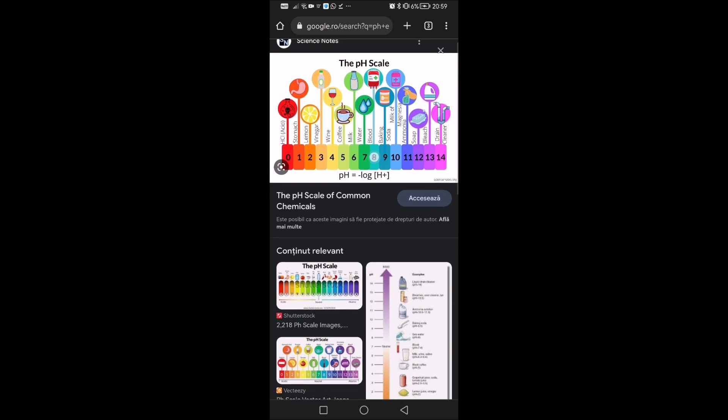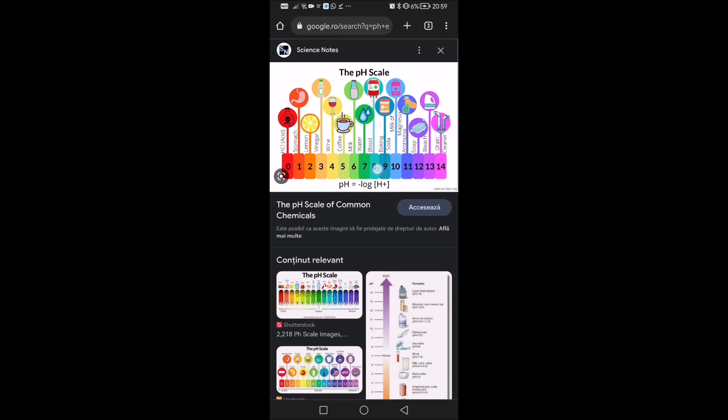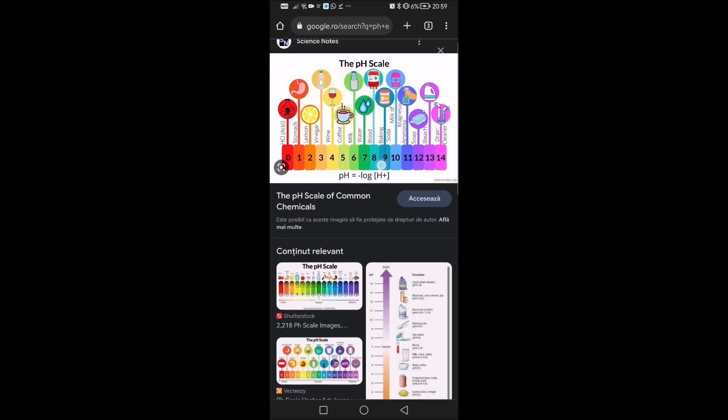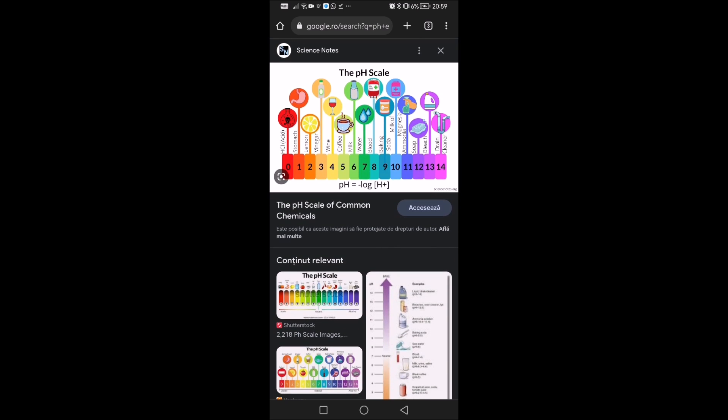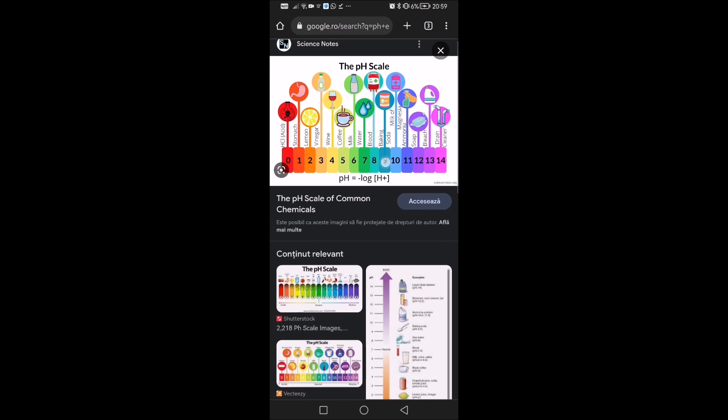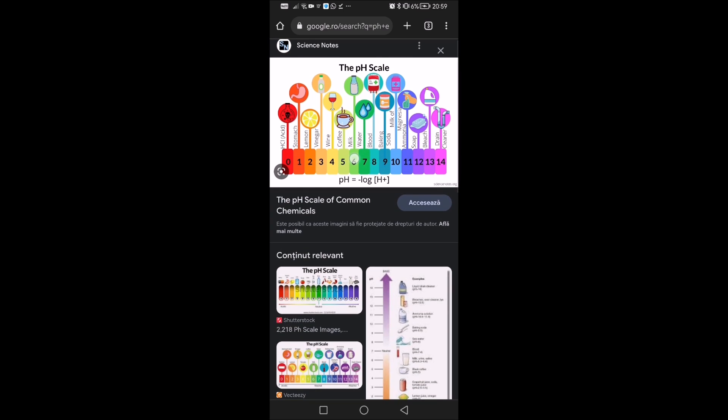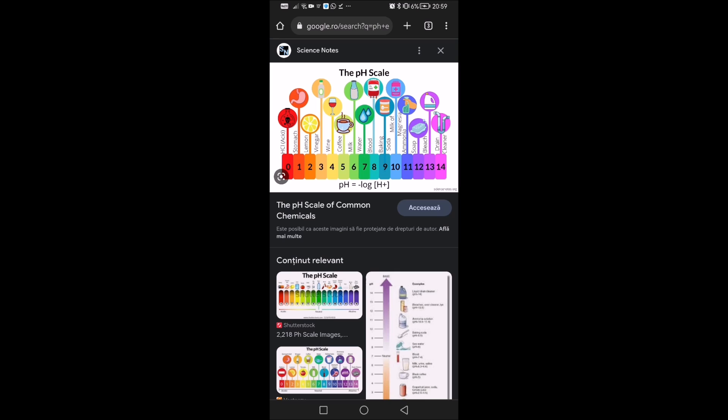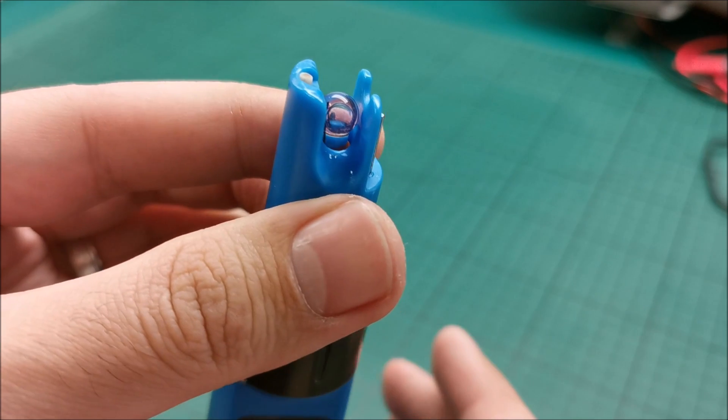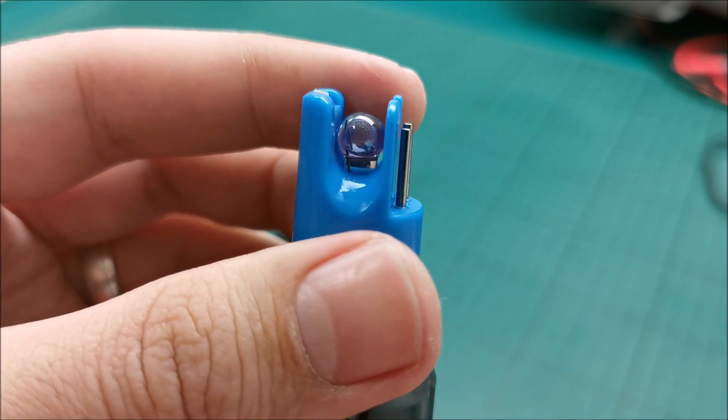So yeah, this kind of gives you an idea of where you are. And again, some things like milk for example change the pH when they are a bit old, so you can make an idea of how old they are based on the pH test. For me it's quite clear I need to be reading a little bit more about these things, but overall the soil that I tested is not as bad as I thought and the mineral water is exactly as I thought, it's more on the acidic side, so not great if you have stomach problems.